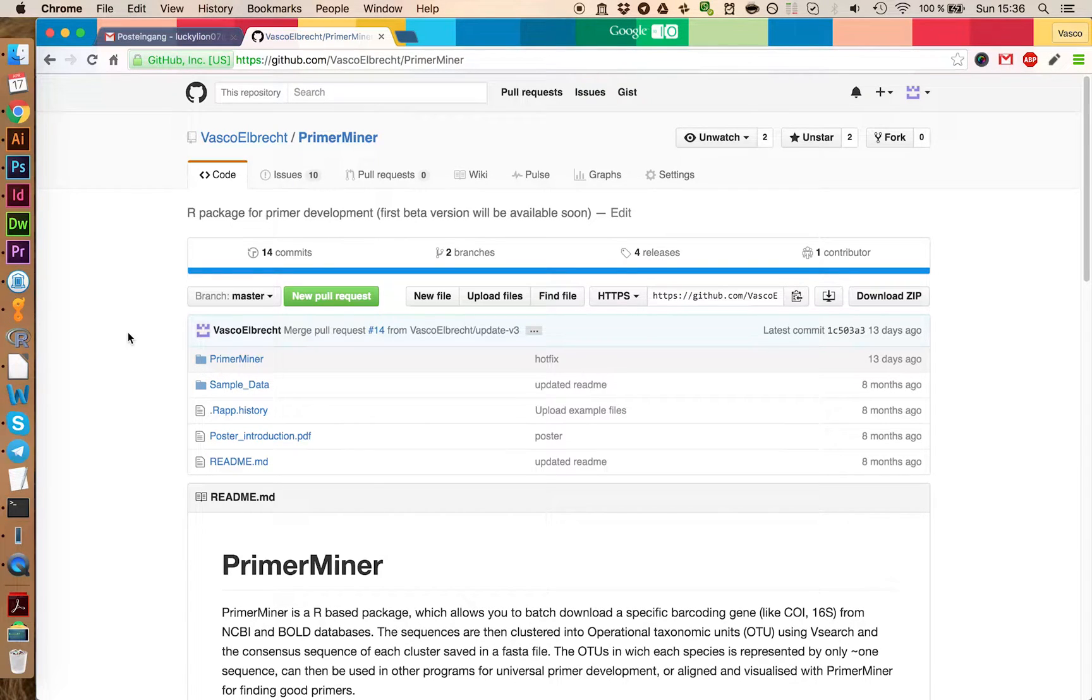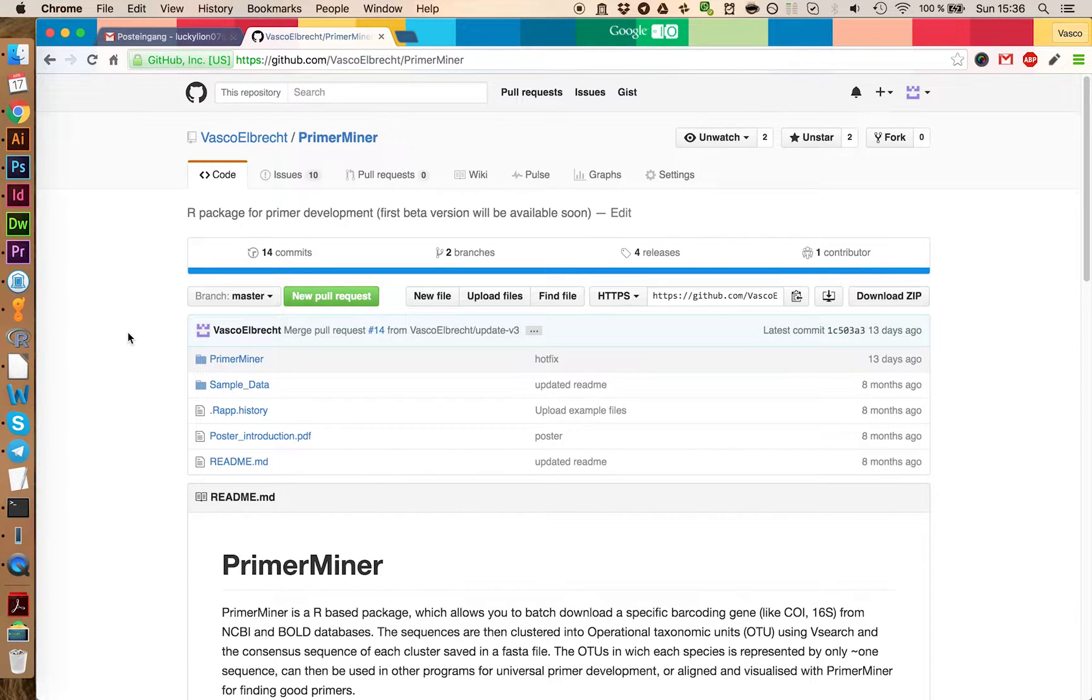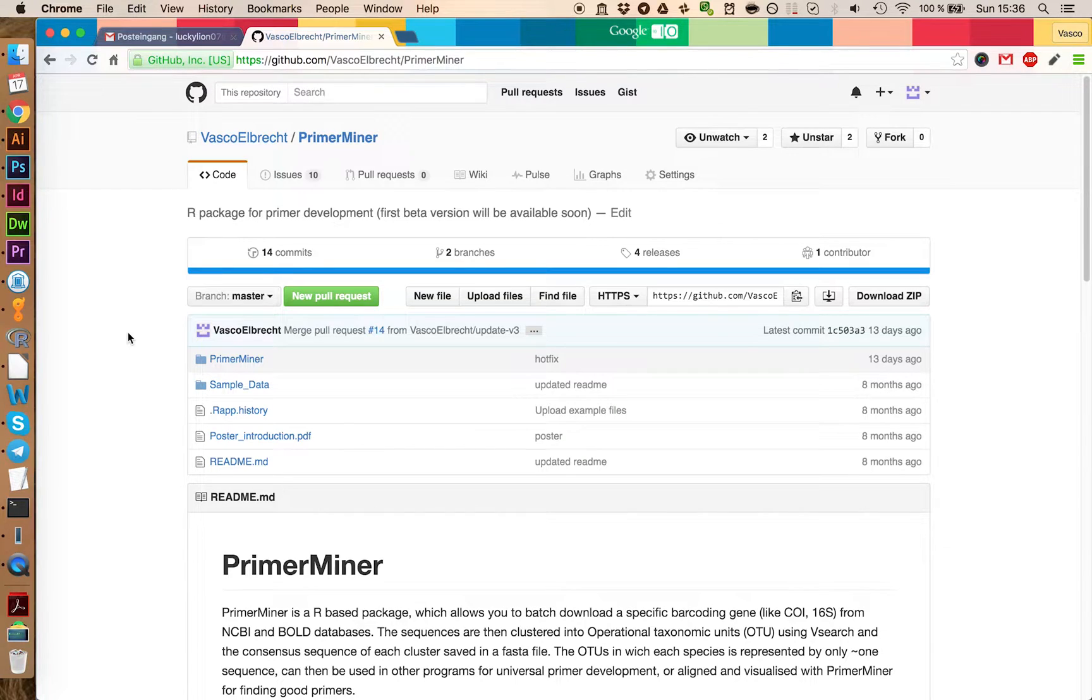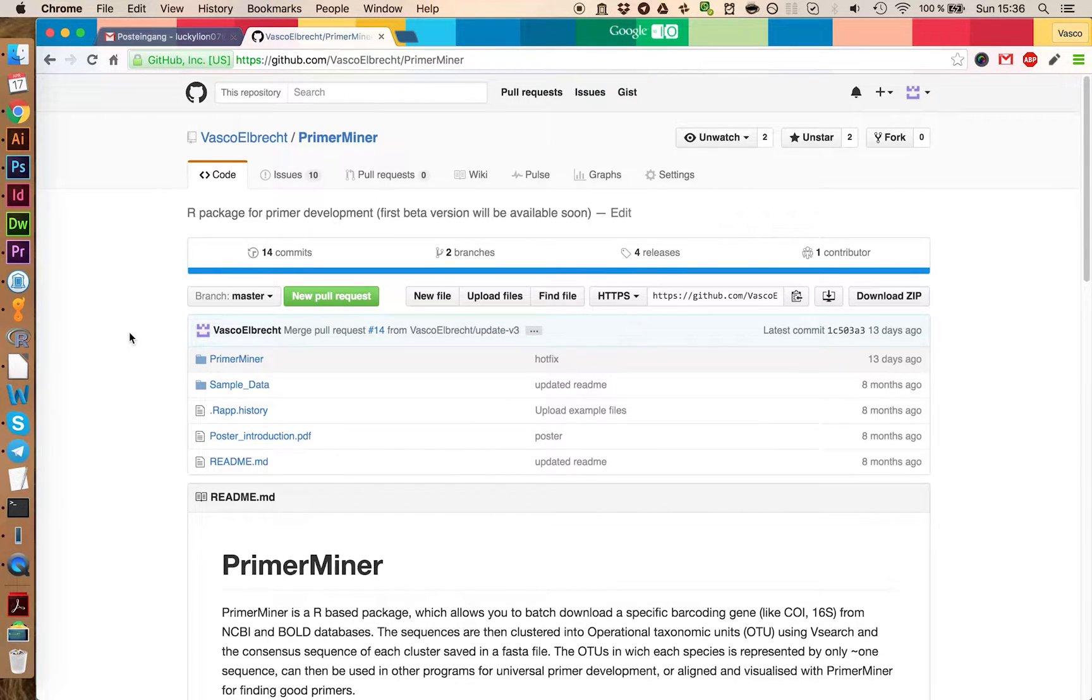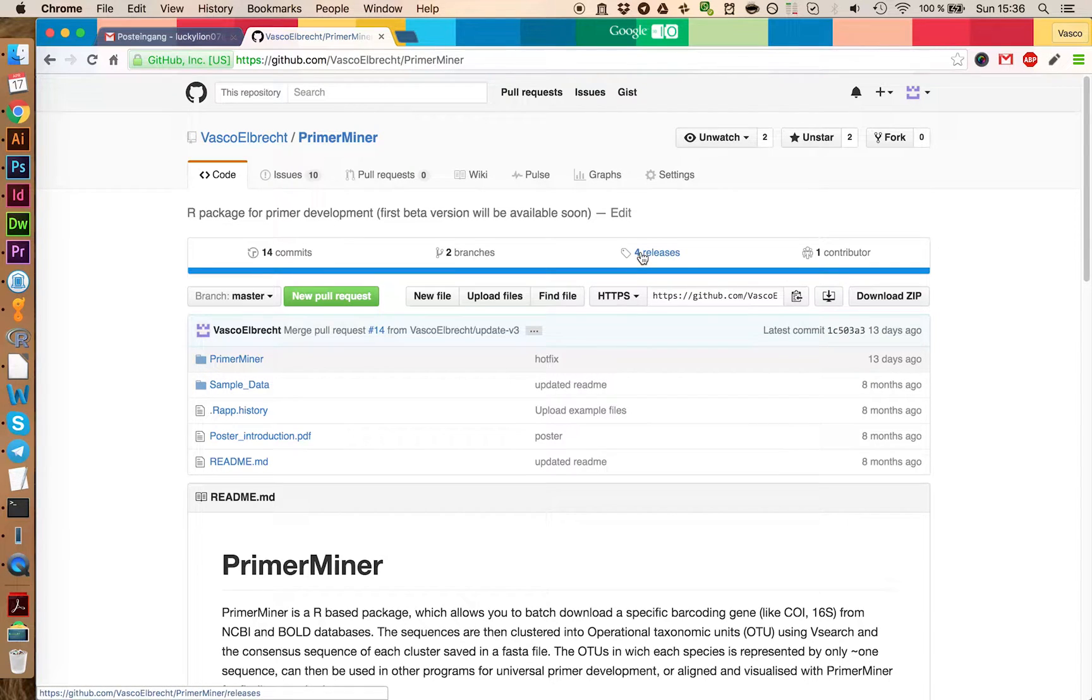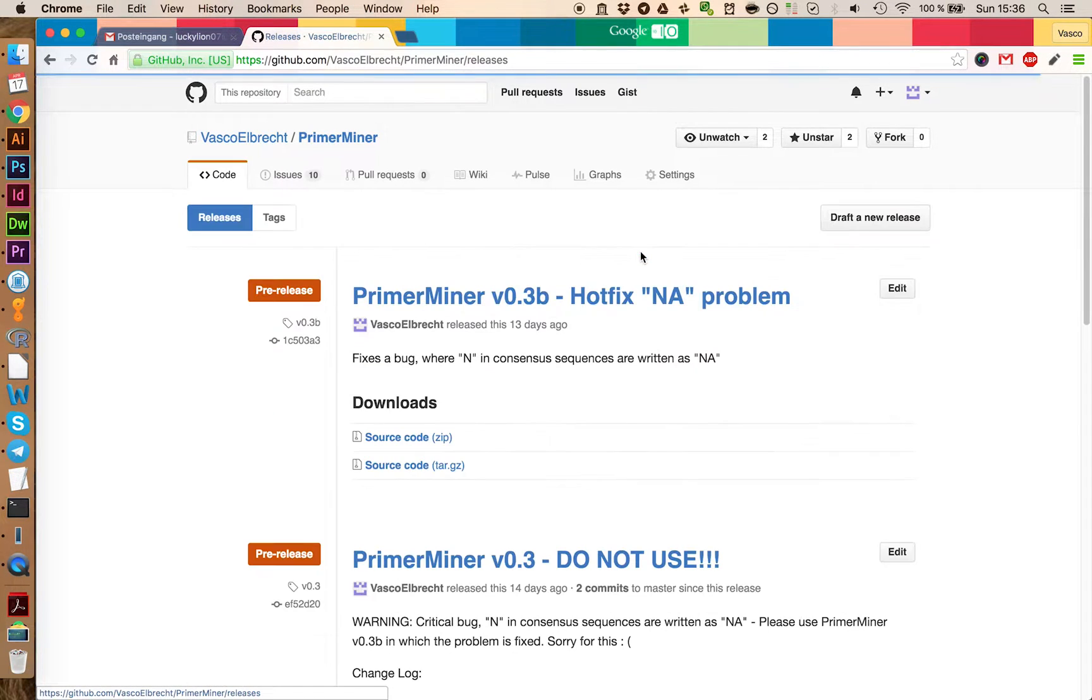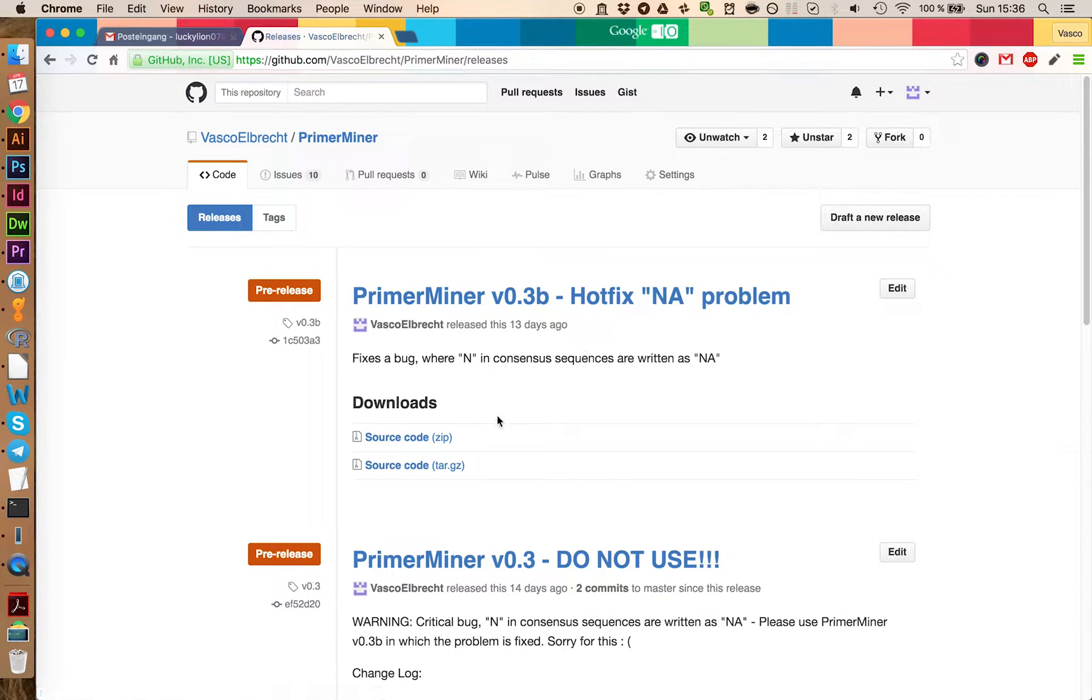We recommend to use PrimerMiner on a Mac operating system and you need to have R installed. You can download the latest PrimerMiner version if you go on releases and download the latest version here.